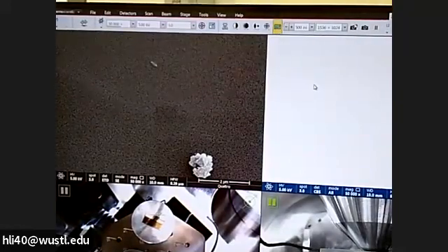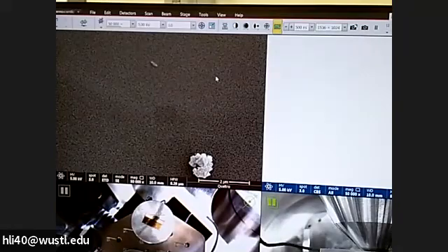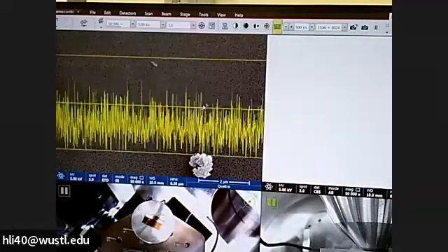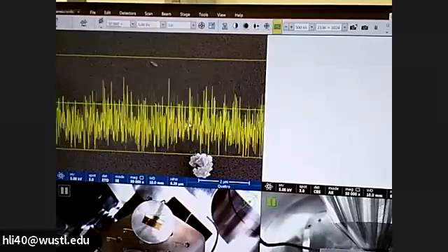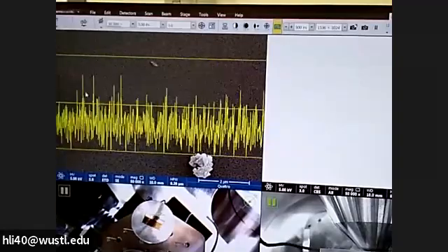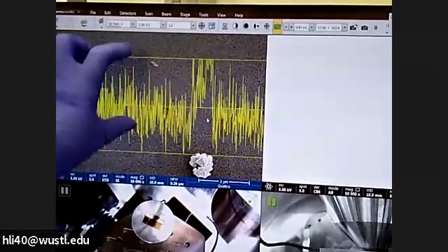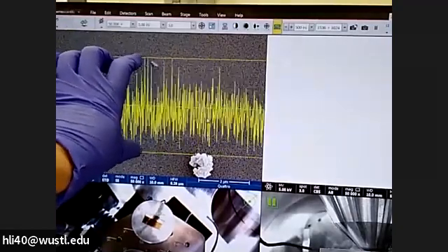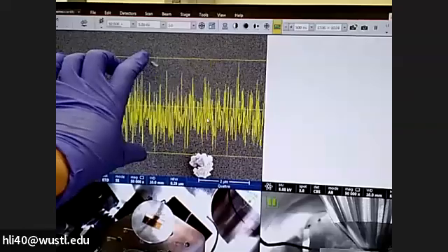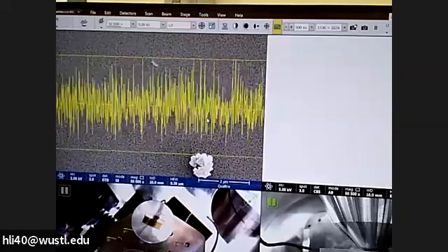Okay. So if you cannot automatically adjust, I still would like to see whether we can make it. So you can use a video scope, which I click here. If I click this screen, you will see the video scope there. You will see some noise. This gives you a line scan update of the signal as you scan across, so it's changing. To make good contrast and brightness, we normally make this noise sit between the upper yellow line and the lower yellow line, and the brightness around the middle line. So this is how we adjust. So you will get a much better looking image.